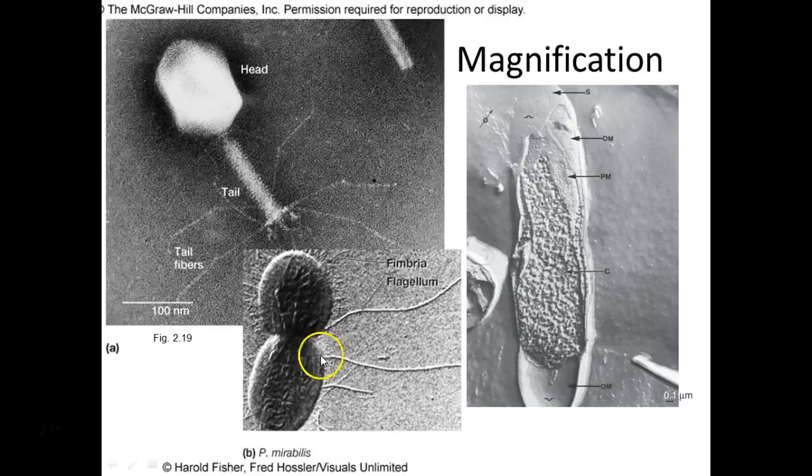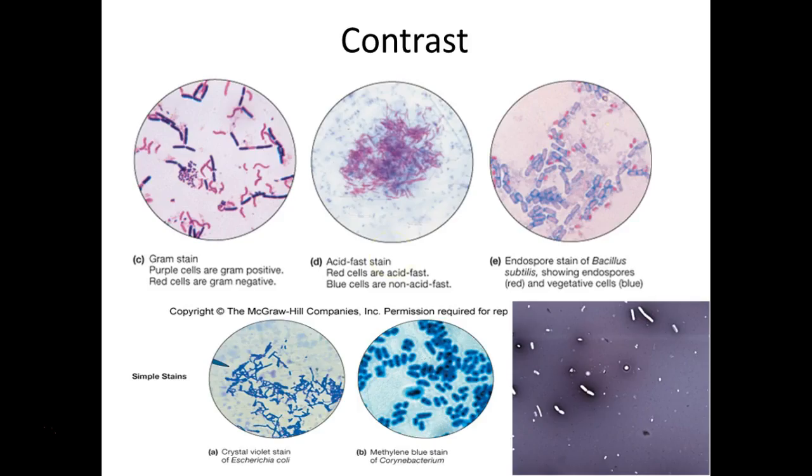This is a bacterium, actually probably just getting ready to divide into 2. But you can see these long flagella and fimbriae structures we're going to talk about in the next unit. Under the light microscope, you wouldn't see these much finer appendages. You'd just see the bacteria, and even then they'd look really tiny. This is a special procedure where they've etched away the layers of the bacteria so you can see the different layers. Now sometimes electron micrographs will be colored, just like people used to take old-time black and white photos and literally paint or color on them. They do the same thing with electron micrographs.